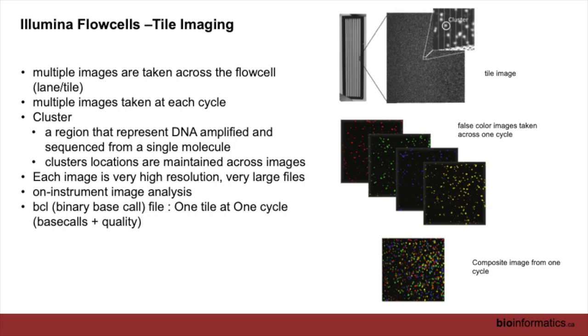What happens on the Illumina instrument is these are analyzed as they're produced, generating what's called a BCL file, binary base call file. Each file represents one tile at one cycle, and that information contains both a base call and an assessment of the quality of the base call.